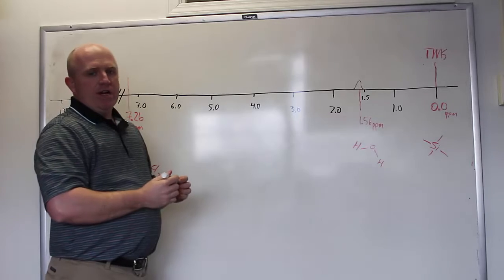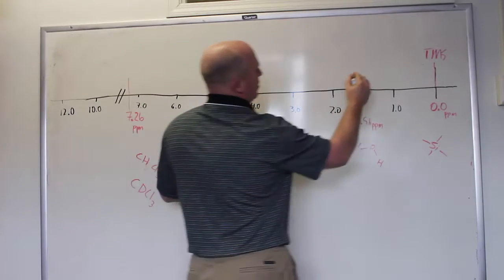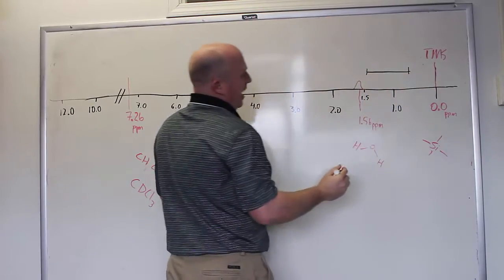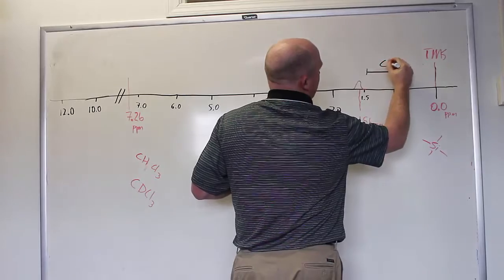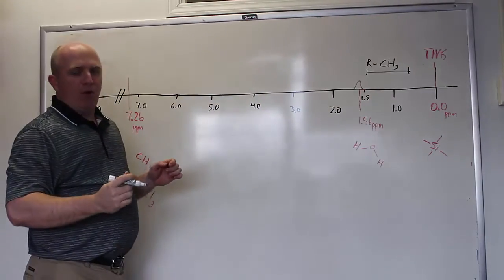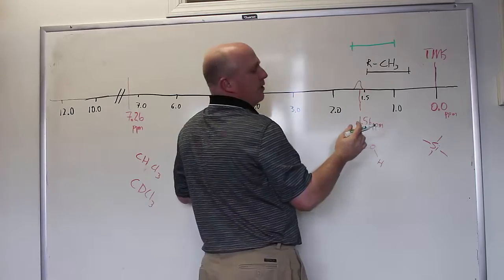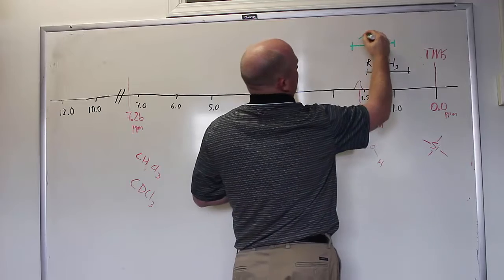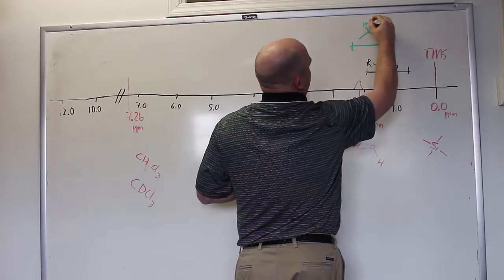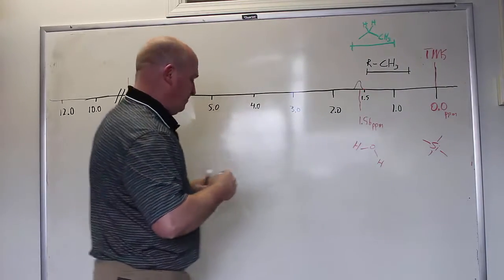Now we come to certain ranges in proton NMR that are of interest. Methyl groups tend to show up down in this general region, between say 1.5 and about 0.8 or so. And that is methyl groups. Said another way, that region is pretty boring, but usually you have methyl groups in that area. Between 1 and 1.5, we tend to have things that are like CH2s bound next to a methyl group. So again, relatively boring alkyl stuff will tend to show up in that range.